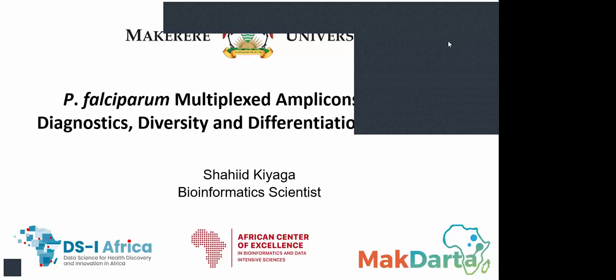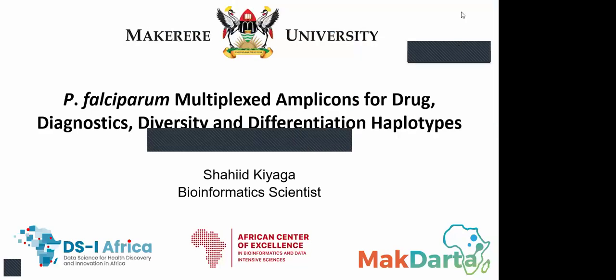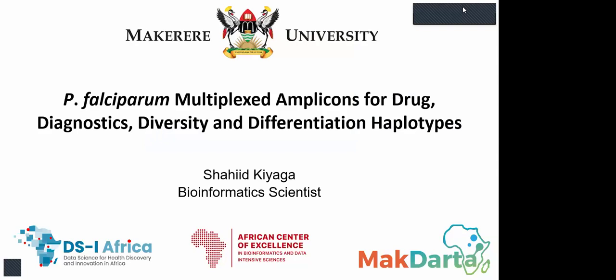So to start with, I'm going to present this tool, but in general terms, this whole idea is about Plasmodium multiplex amplicons for drug diagnostics, diversity, and differentiation haplotypes.